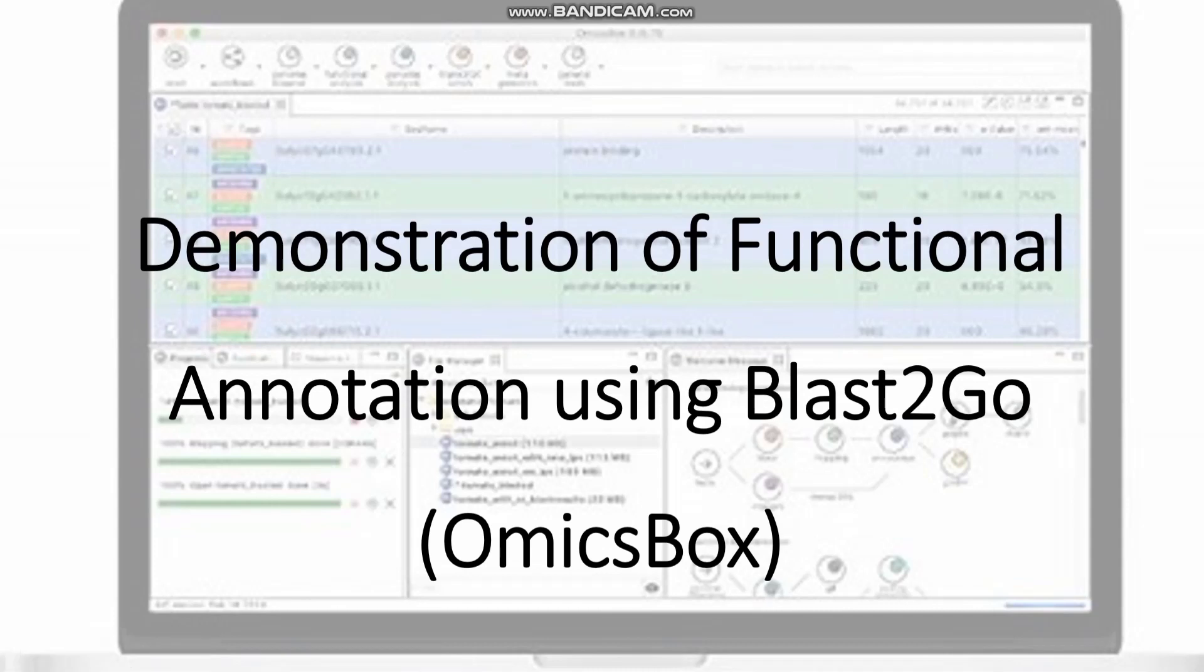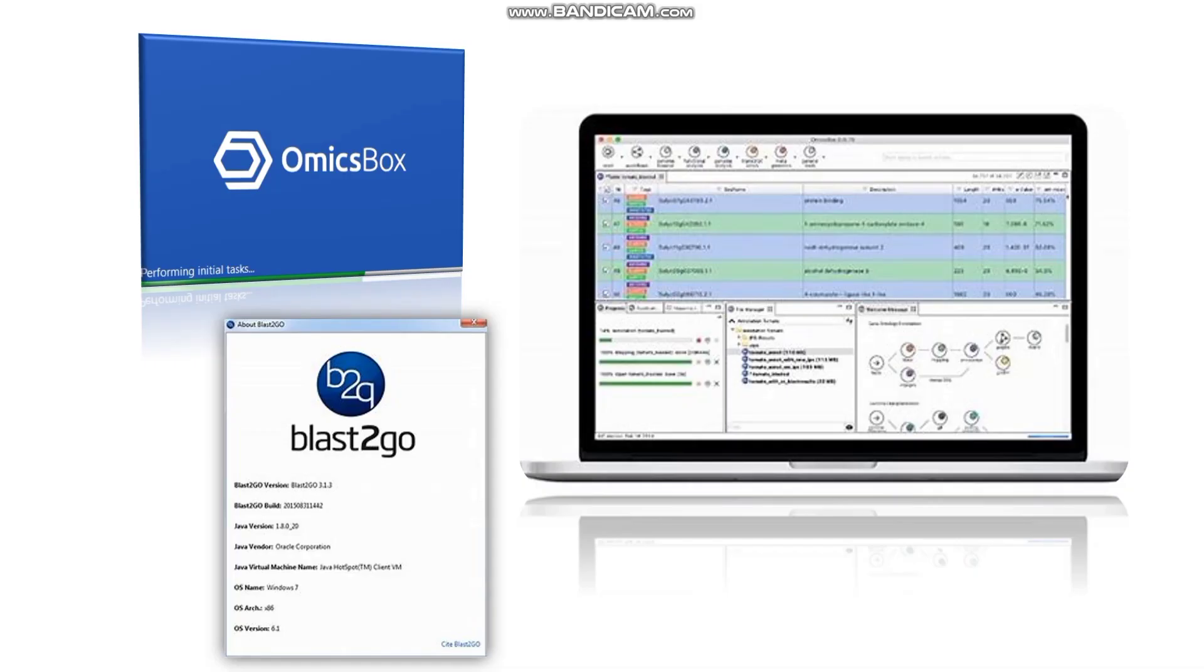Welcome to the demonstration of functional annotation using Blast2Go OmicsBox. OmicsBox is BioBam's user-friendly all-in-one analysis software for NGS data. It performs four modules: genome analysis, transcriptomics, functional analysis, and metagenomics.